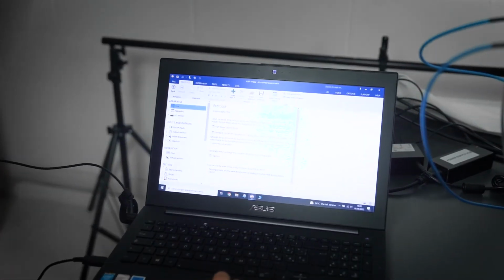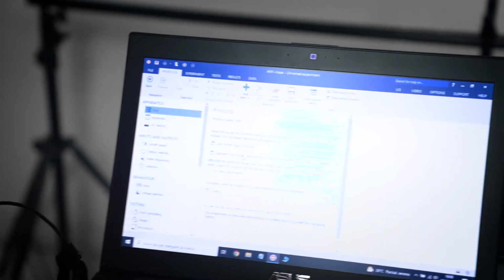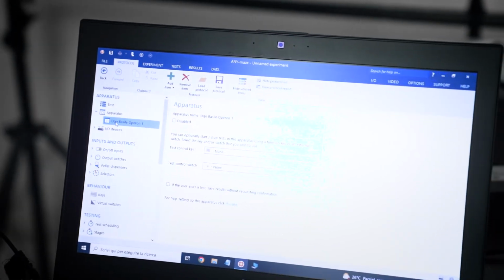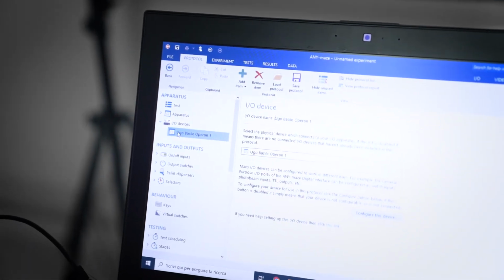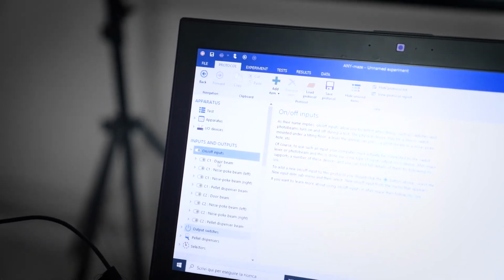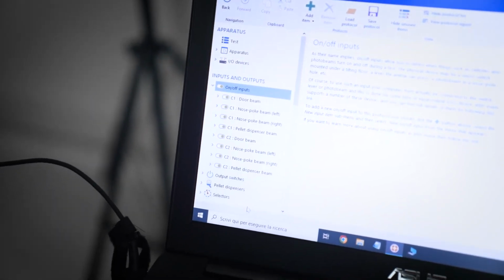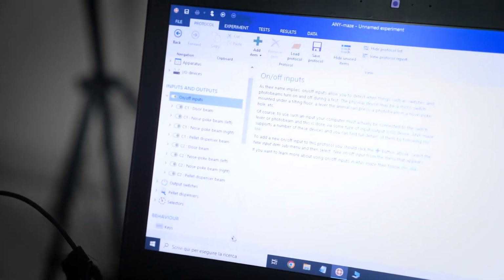As you can see, we have an Ugo Basile Operon mode with some standard sub mode, which prepare animals already for working with this apparatus. Okay, and all the I/O devices are here, but nothing needs to be done because it is already pre-configured. But you still have here the possibility to see what is happening in the different switches which I showed you in the I/O selector.